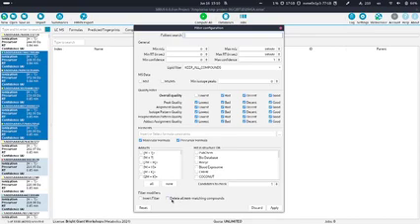But if we enable this checkbox, it will be deleted from your project space, but of course the data will not be deleted, so the mzML will not be affected. But the project space can be a little bit smaller. I think it also happens now that project spaces can get a little bit big, so maybe if you want to share your project space and you don't care about many compounds, you can just really delete them.